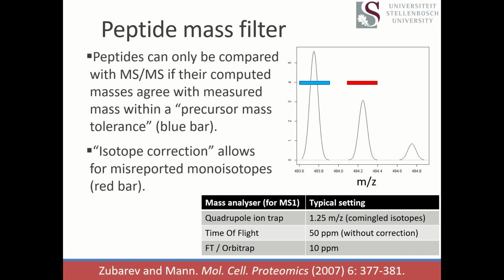The other thing about them, though, was that their measurements were all imprecise mass accuracy. So you would say that it had unit mass accuracy.